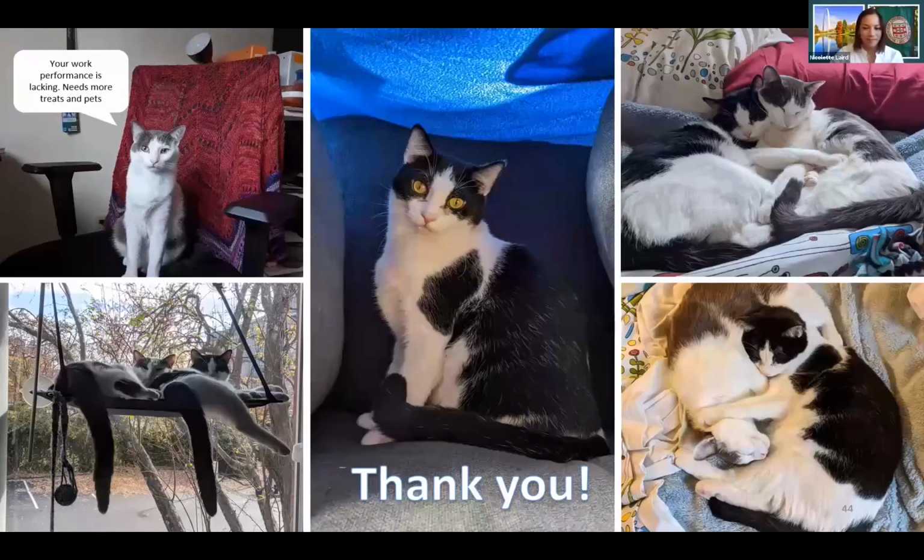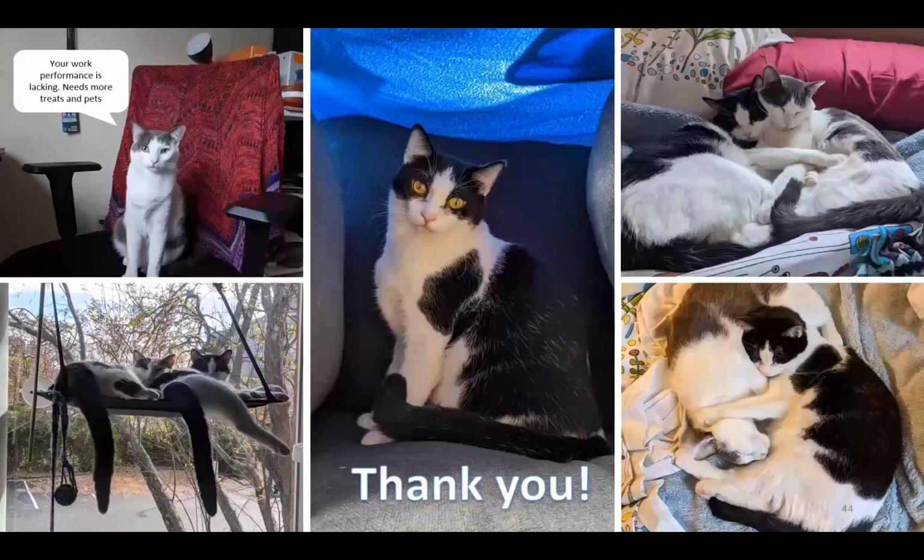Thank you, Nicolette. Do we have any questions? I have a few questions. I guess from your presentation, it seems like your program analyzes one worm at a time. Is there a way to analyze multiple worms? And is there a way to track a specific worm over time, or do you have to track them manually?